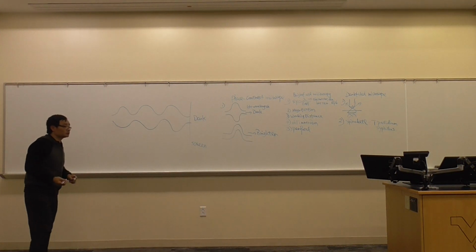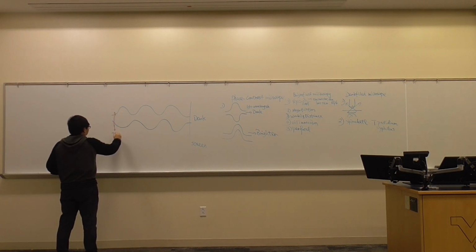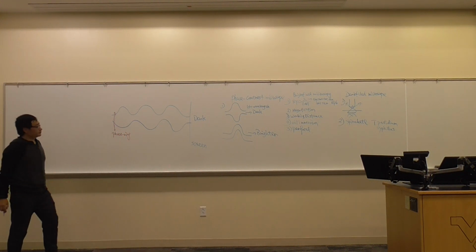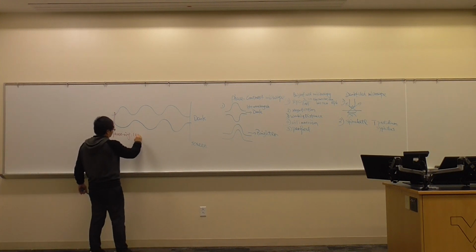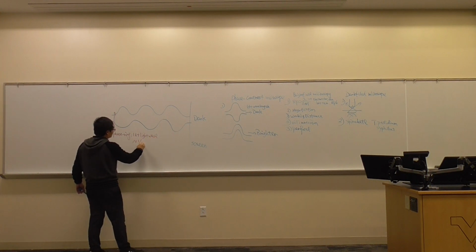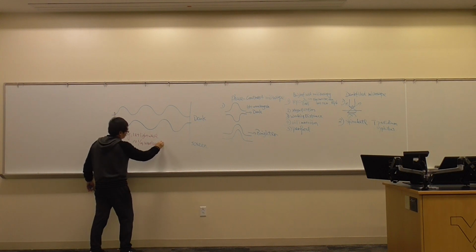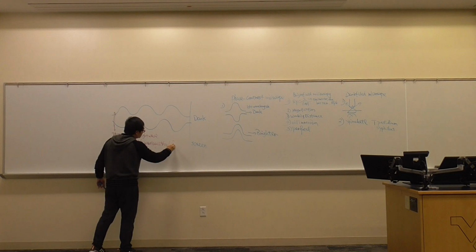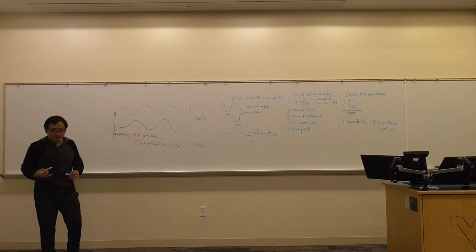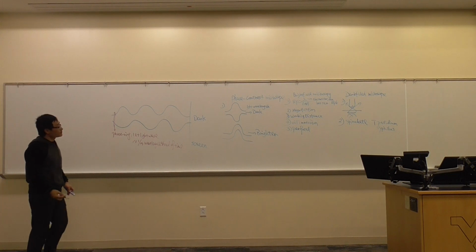So what do they do? These guys are very smart. They're physics people. They put a ring here. This is called a phase ring. What's the function of the phase ring? They will let the light wave go approximately 1/4 wavelength ahead of time. Sometimes a phase contrast microscope will be back 1/4 wavelength. Most of the time it is 1/4 wavelength ahead of time.